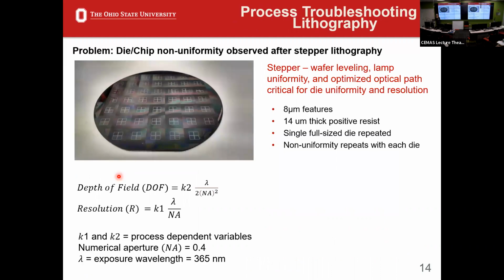Okay, so this goes back to one of the images on my first slide. If you look at this wafer, you can see that the color is not uniform. So we strive for everything to always be uniform. It should be the same color. If there's color non-uniformity, it means that there's thickness non-uniformity, or it means that there's a problem with the pattern. So we could tell this just from looking at the wafer when it came out by eye. Didn't even need an optical microscope, right?